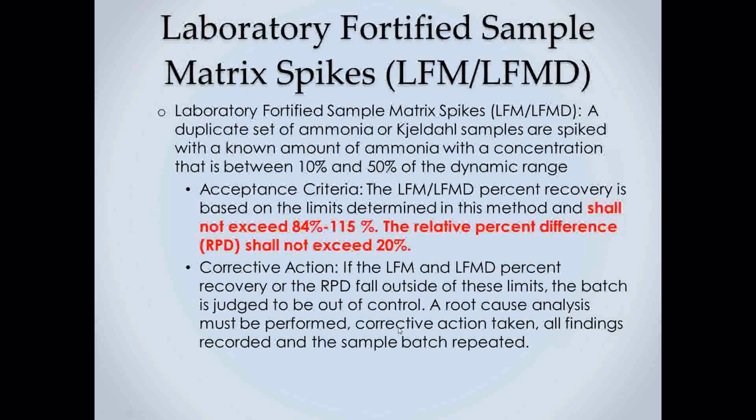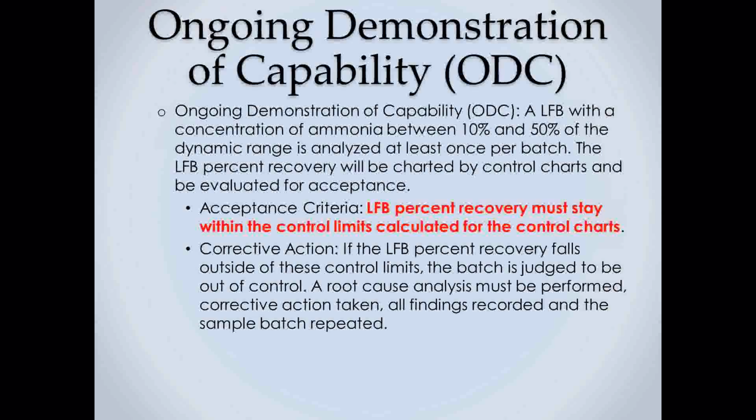So that gives some flexibility to the laboratory and to the auditor on how to look at this ongoing demonstration of capability. But again, if you set up your control charts and you fall outside of those, you're still to be judged to be out of control. A root cause analysis must be performed and corrective action taken.